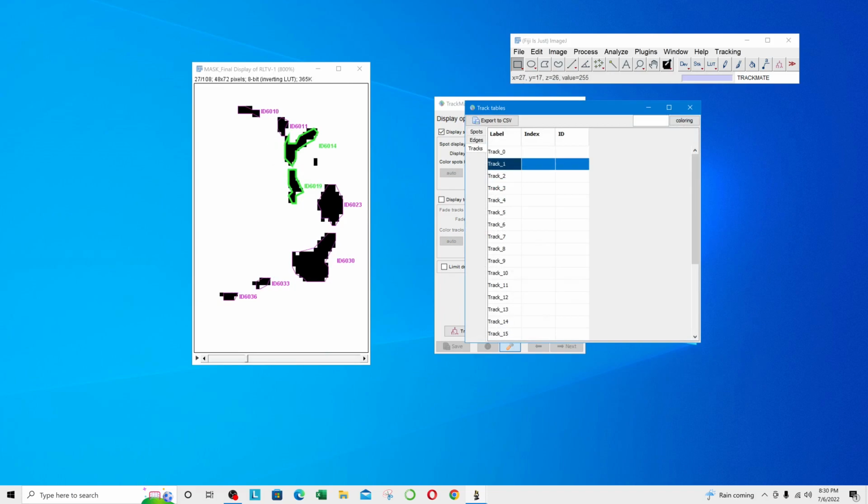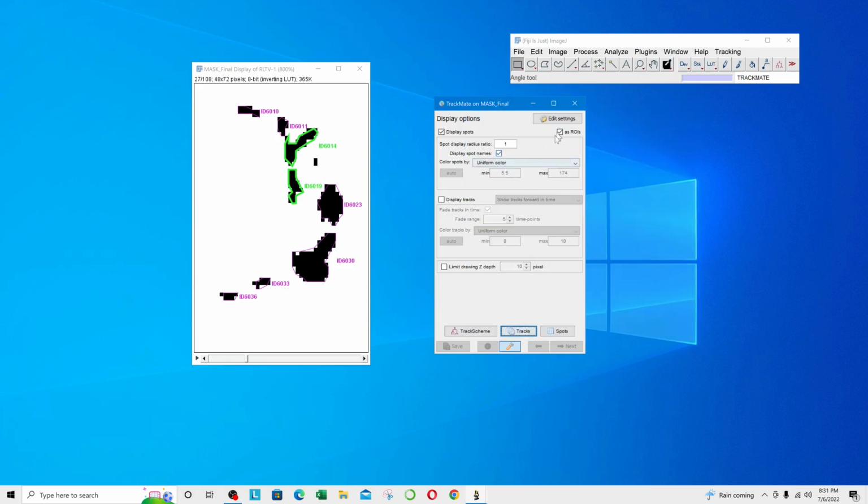My interest is in finding out how many times these mitochondria are splitting. So what we have to do now is, since we have these tracks, we need to be able to merge them together and keep track of a single ID that is associated with the biggest mitochondria, so that anything that gets merged into it gets that same ID number, and when the fission happens, the track ID will continue with the daughter but in a different way. So that way we can track the number of events that are taking place.